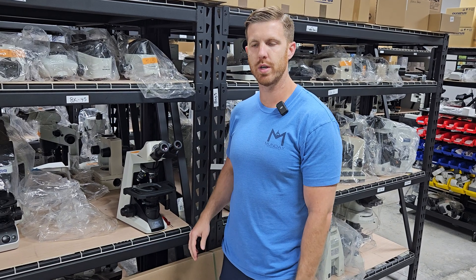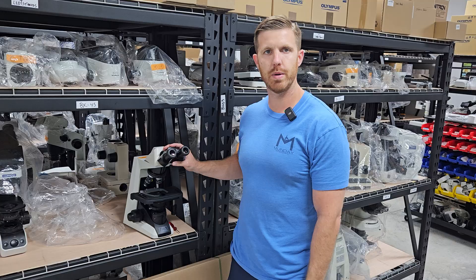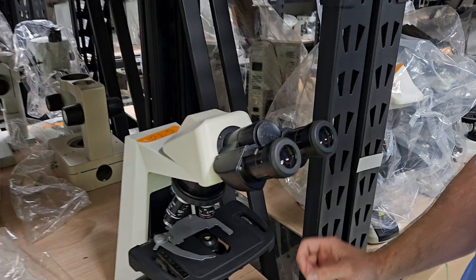Hey, this is Chad with Munday Scientific, and we're going to talk about taking your eyepieces out of your microscope head. Sometimes this can be a little tricky. Mike's going to come in and we're going to show on an E200.